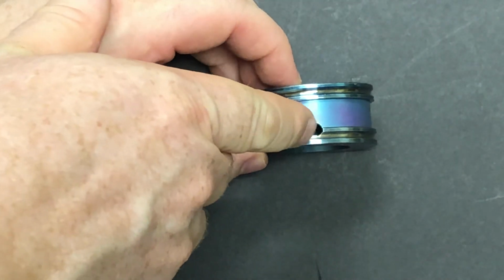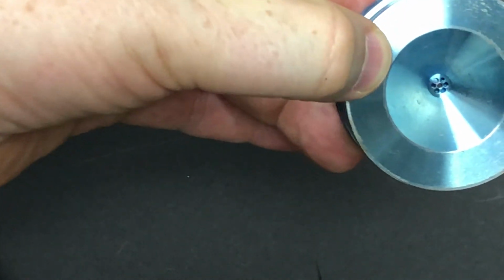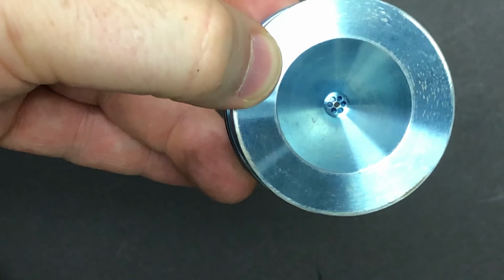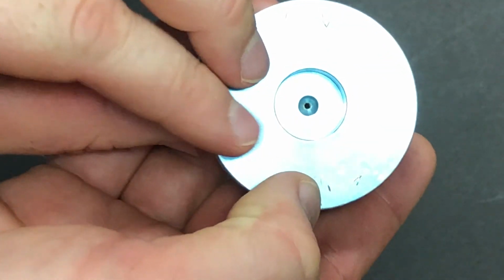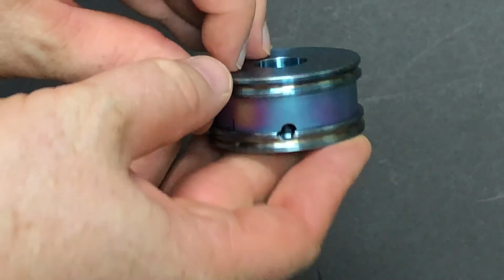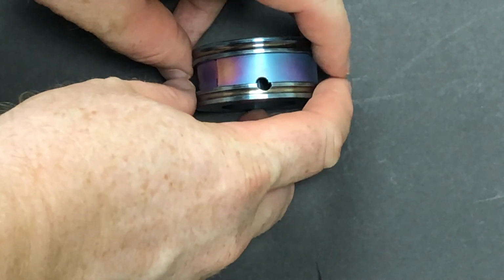You can see that hole right there. You can actually put the GC column in there and spray neutrals directly in the trap. Now on this end cap, we have those perforated holes for ions to pass through. In truth, in this case, it's for electrons from the EI source, but most of the time it's for ions. On the other side, the other end cap has that pinhole. That's where ions are going to be ejected from the ion trap and hit the detector.